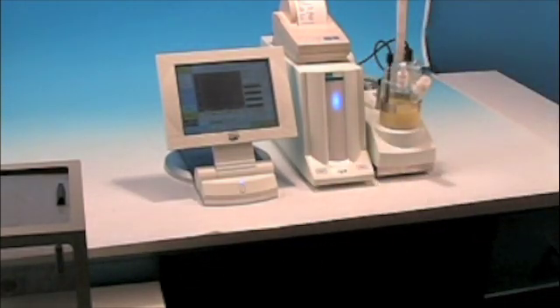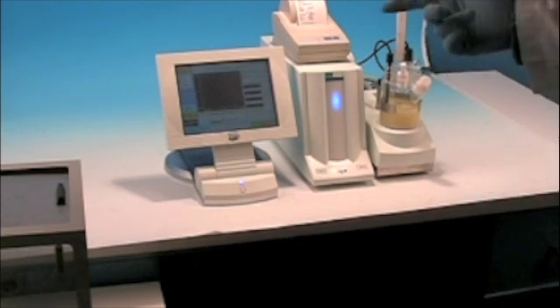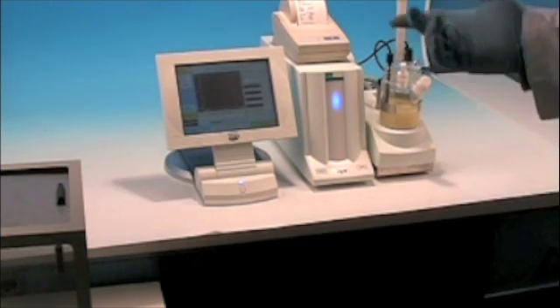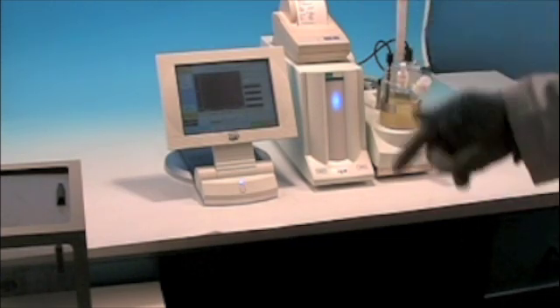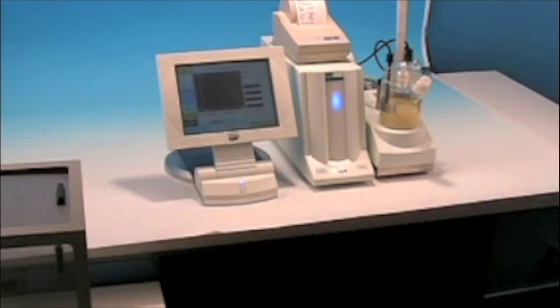And this is the unit, and you'll see in some later video how easy it is to run the test, input your weight, and get your result back very quickly.